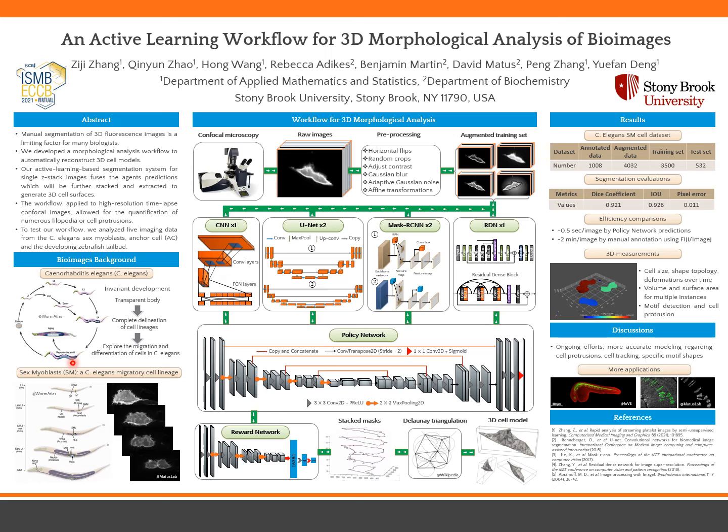Several signaling pathways have been identified by classical methods, but the cell biological mechanisms underlying SM cell migration and pre-differentiation still remain largely unknown. To explore the cellular mechanisms, high-resolution and time-lapse microscopic images are often used to help analyze the behaviors of SM cells in vivo.